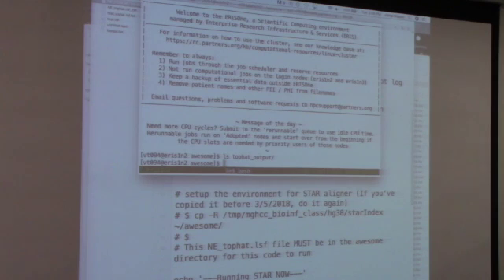We're gonna have an error with all of the... So it's still running, which is a good thing. That means that it's gonna create the info files. I mean, this looks right. Your username slash awesome. So if it is running for a long time, then it's good. If it finishes really fast, then it's bad. Right?